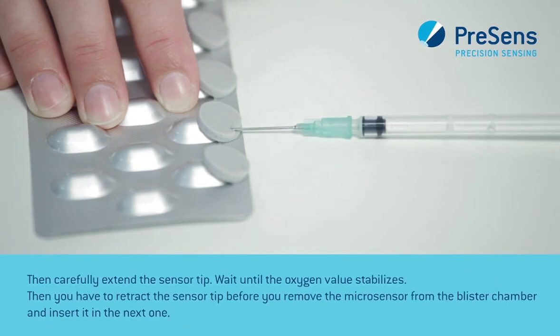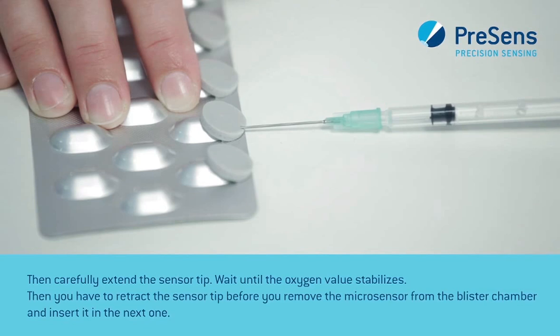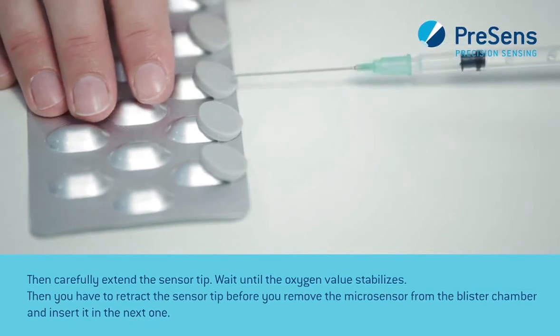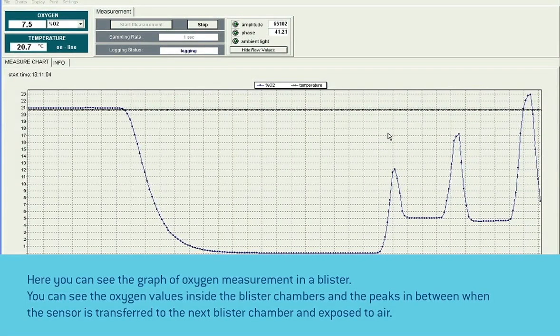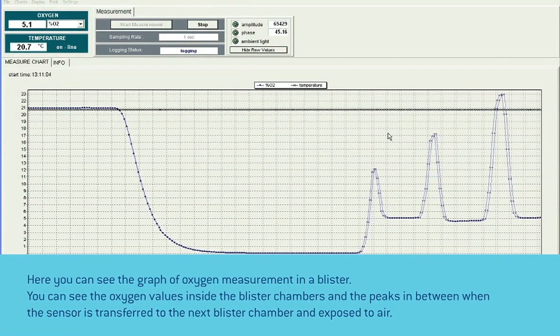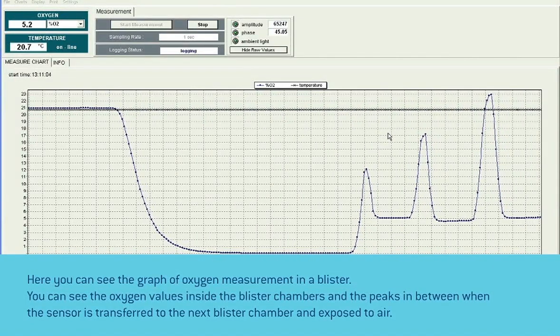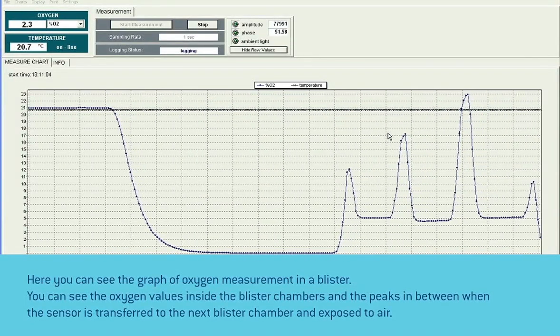Then carefully extend the sensor tip and wait until the oxygen value stabilizes. Retract the sensor tip before you remove the microsensor from the blister chamber and insert it in the next one. Here you can see the graph of oxygen measurement in a blister — the oxygen values inside the blister chambers and the peaks in between when the sensor is transferred to the next blister chamber and exposed to air.